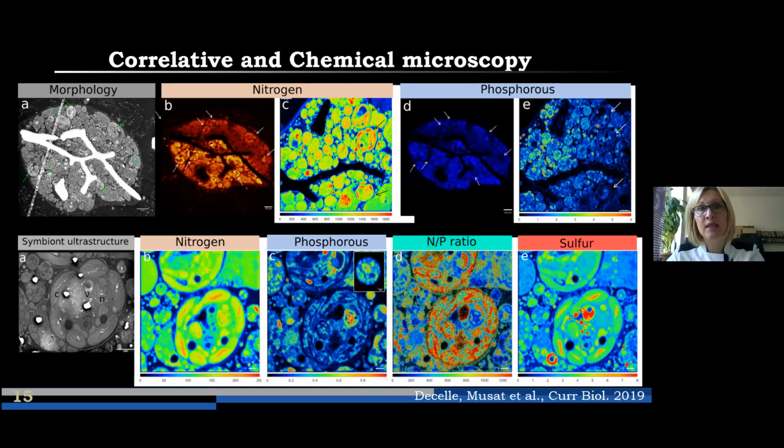And here I have an example where we combine transmission electron microscopy. First of all, the whole marine organism was embedded in resin. It was sliced into small slices, like you see here in the left corner. And with a green arrow, the symbionts within the host tissue are pointed out. This is TEM, also A up and down, they are both TEM with a different resolution. Here you have an overview, and here you have just one symbiotic cell.